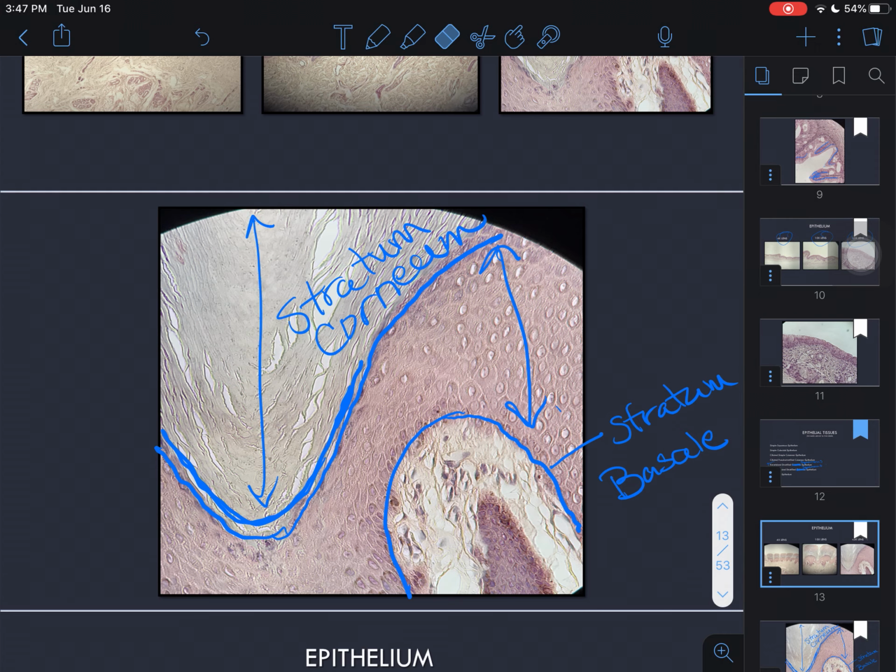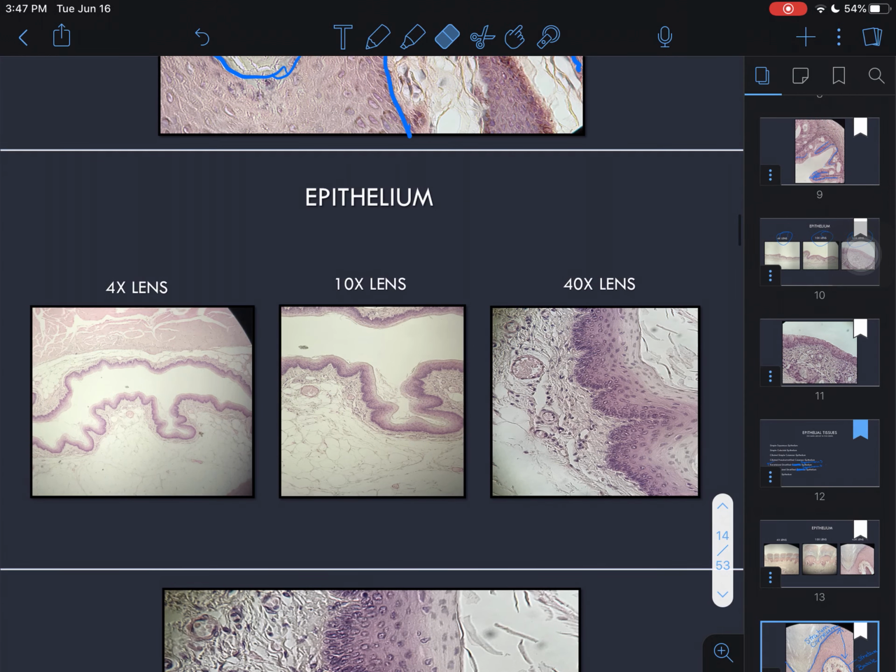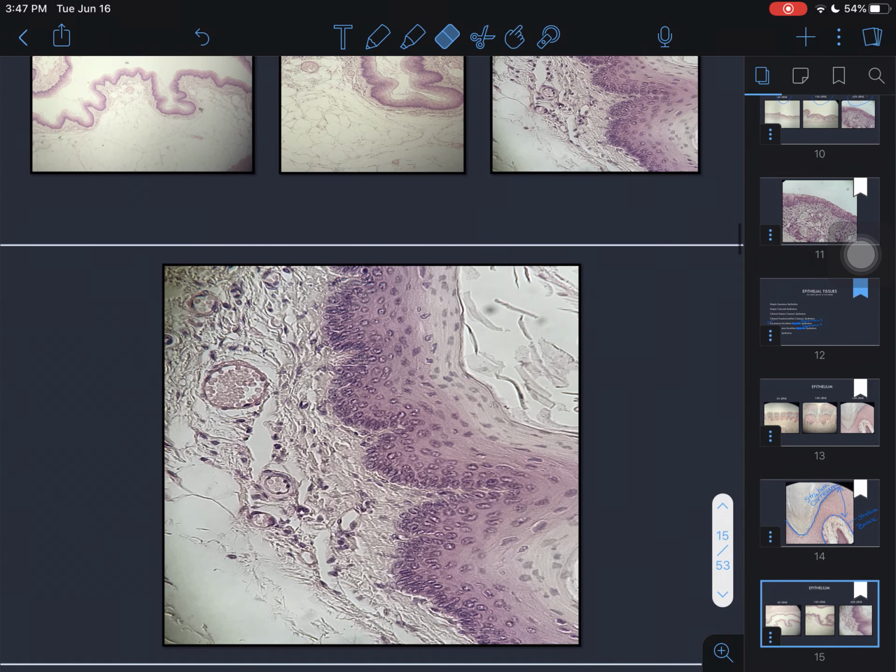Here's the main difference between the keratinized, which remember is this dead section up here, and non-keratinized. Our non-keratinized, here, here, here, I'm going to come all the way down here. These are the dead cells, but notice they're no longer attached. So our actual final layer up here, notice it still has all these dark little dots right here, which are actually still nuclei. So while the skin is dying, right, the first layer of tissue, they're still alive. And this one, you don't have to break into the different layers.